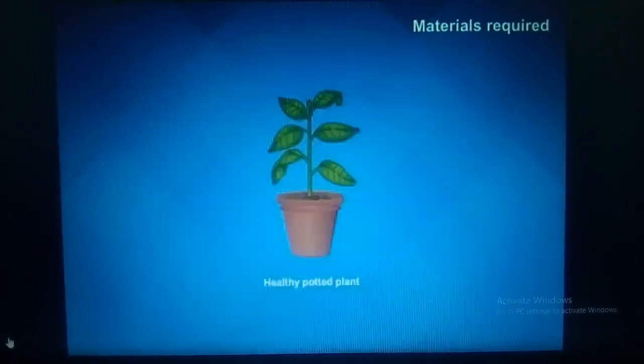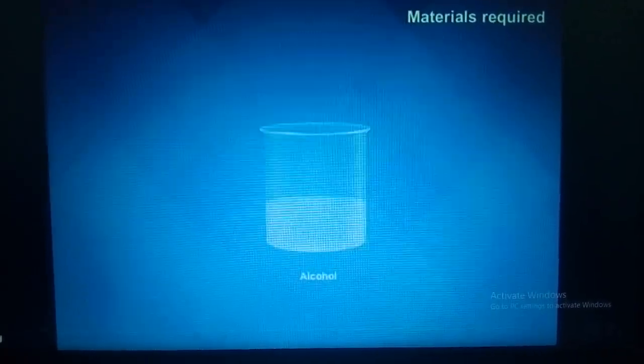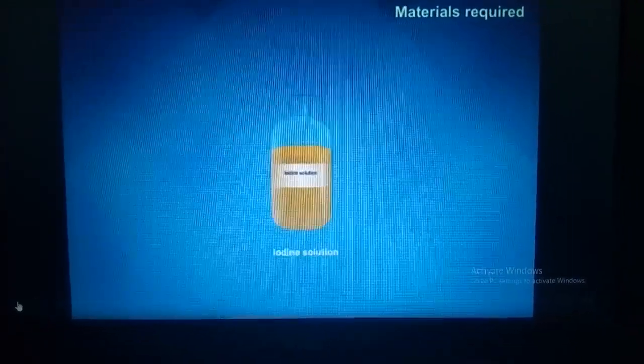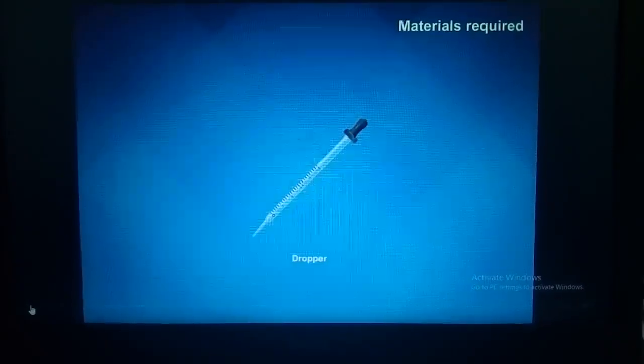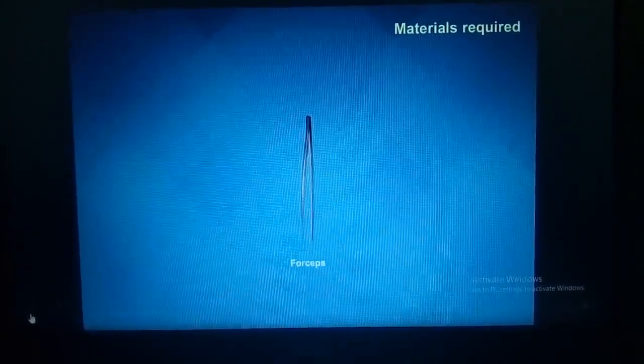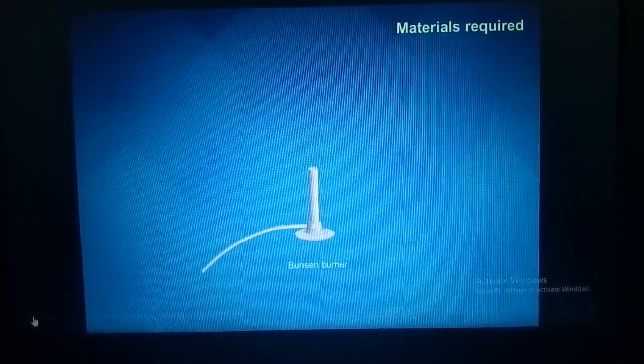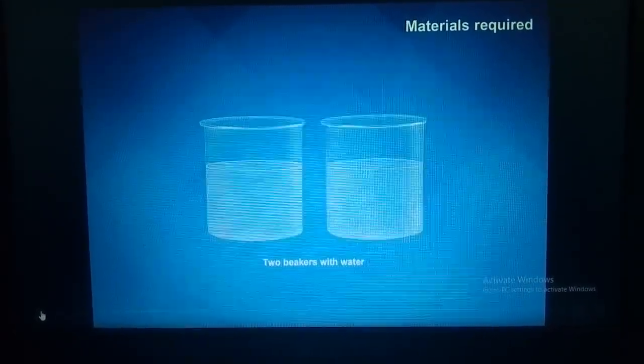Materials required: a healthy potted plant, alcohol, iodine solution, dropper, forceps, tripod stand with wire gauze, Bunsen burner, two beakers with water, watch glass, and a test tube.